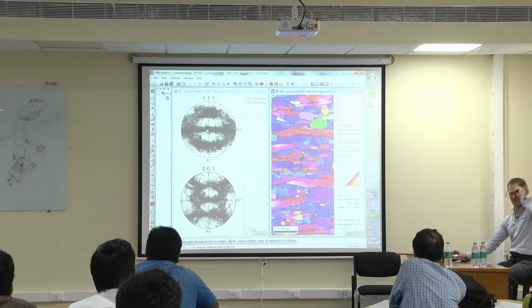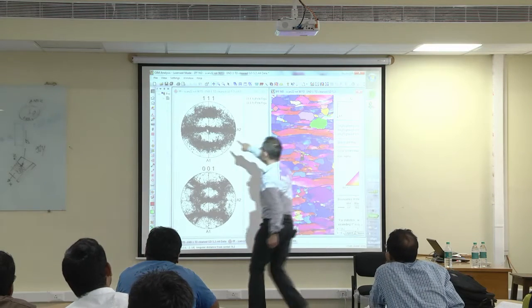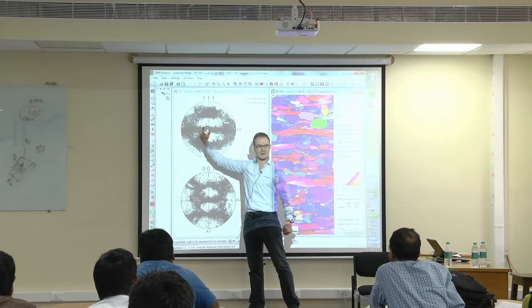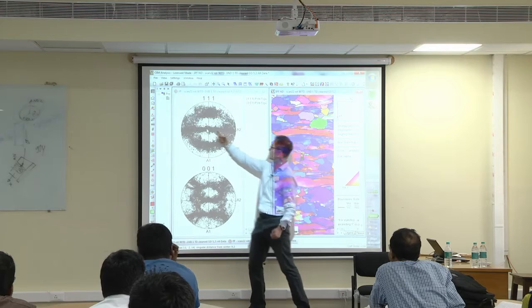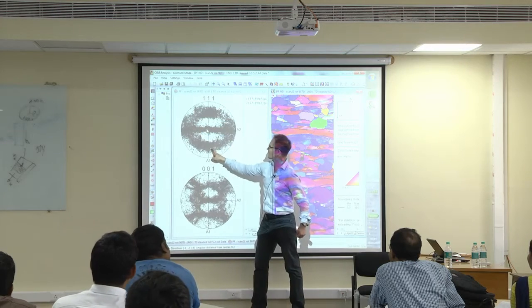And indeed it does, yeah, it's a bit too many points, but I hope you can see that there is now a little green dot appearing here in the center. Yeah, that's exactly this 111 plane pointing exactly in the middle. Now you know 111 planes are 4. There are always 4 111 planes. That means if there's one here, there must be 3 others. And actually this is this, and this.